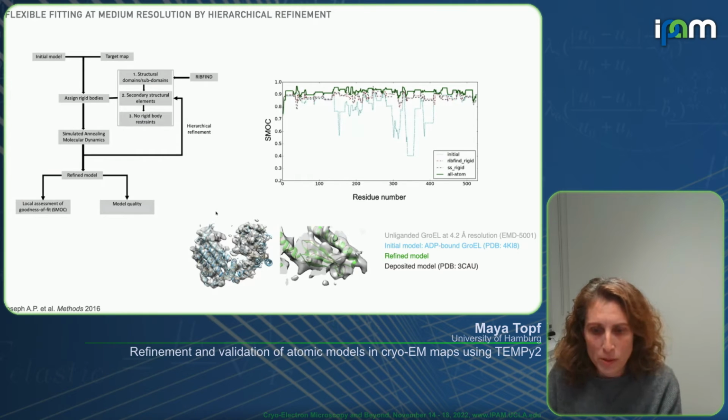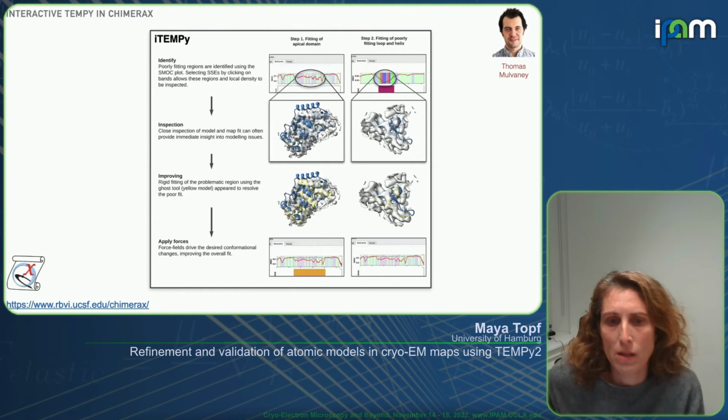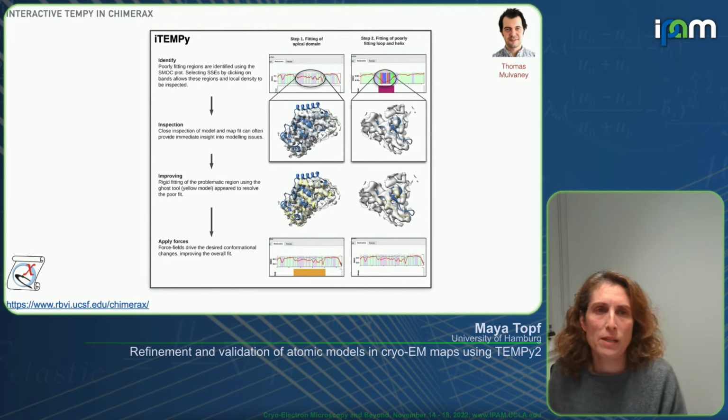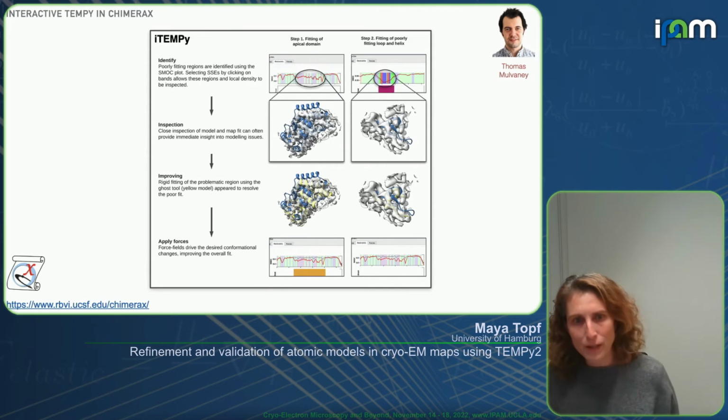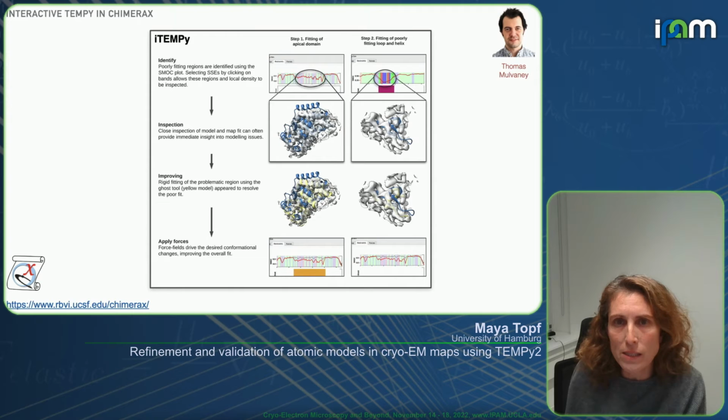Now, fast forward a few years later, and we decided that we would develop the same approach. So we still use FlexEM, but less. A lot of software has been developed since then, and there are a lot of great visualization programs like Chimera and ChimeraX nowadays.